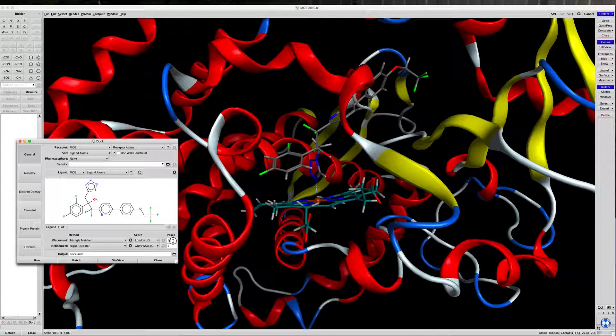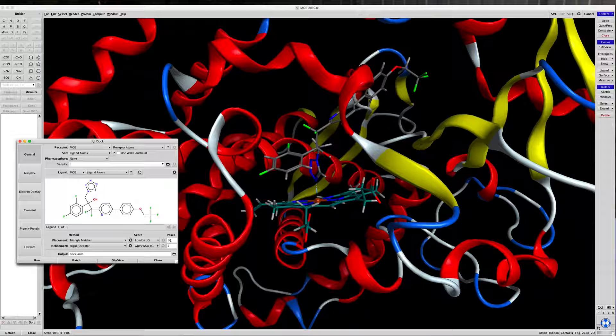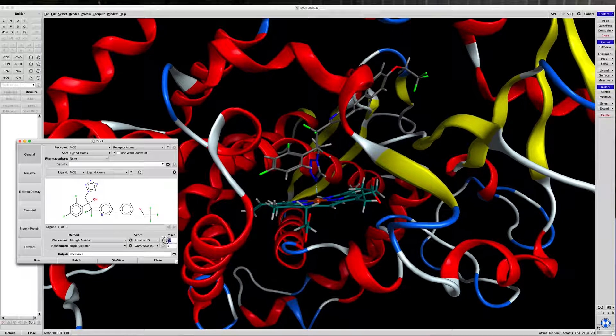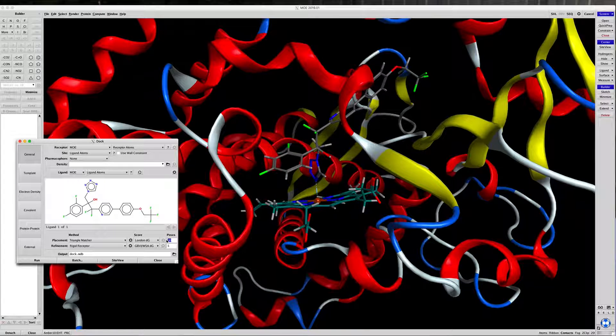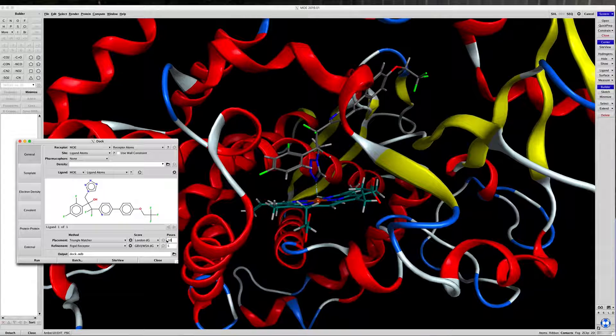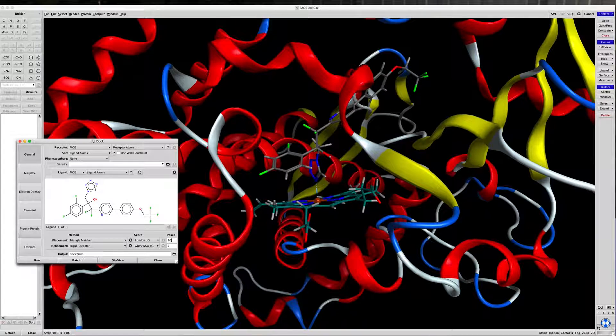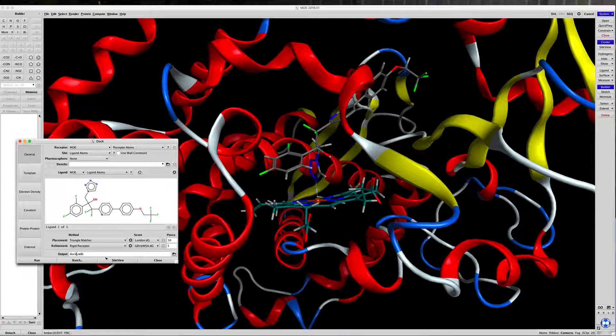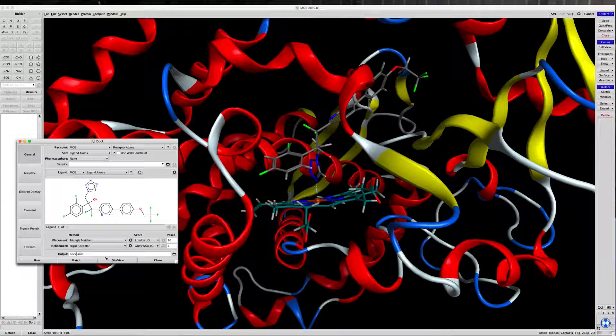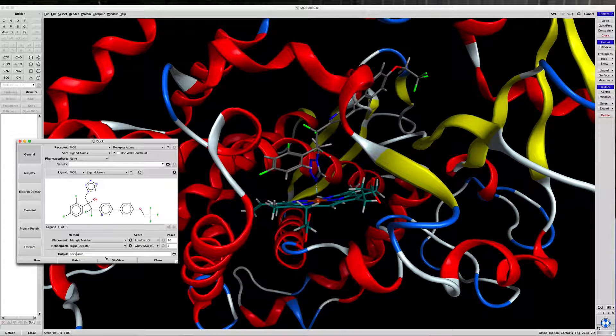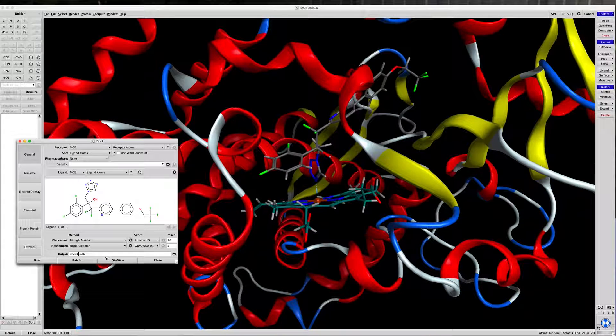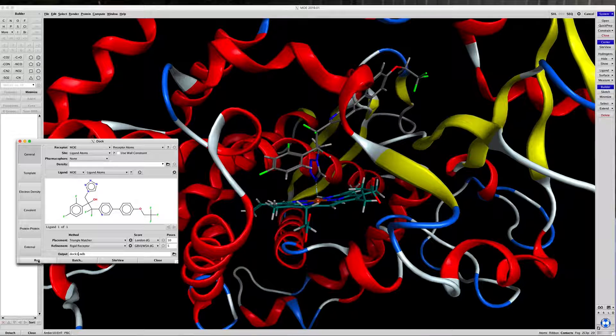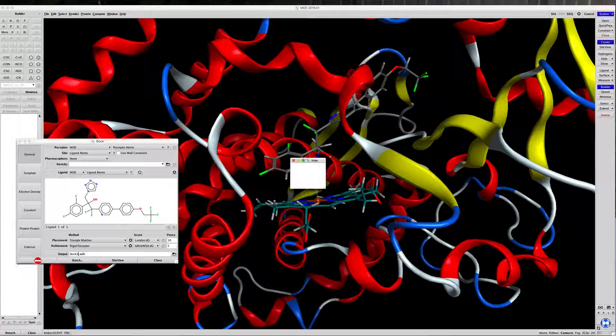Again, we're going to change the number of poses to 10 for the sake of time, and we're going to give the output a unique name so we can find it easily next time. So let's just call it Dock1. Click on Run.